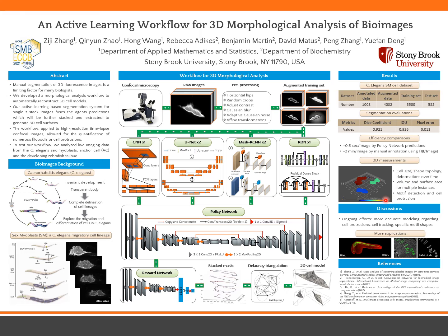Regarding the reconstructed 3D cells, we analyze the cell sizes, cell shape topology, and deformations over time lapse. To further utilize the 3D measurements and explore the cell protrusions, we will detect specific motif shapes, their volumetric statistics, and track them over time. We are also working on applying this method to more applications, for example, the zebrafish tail bud.